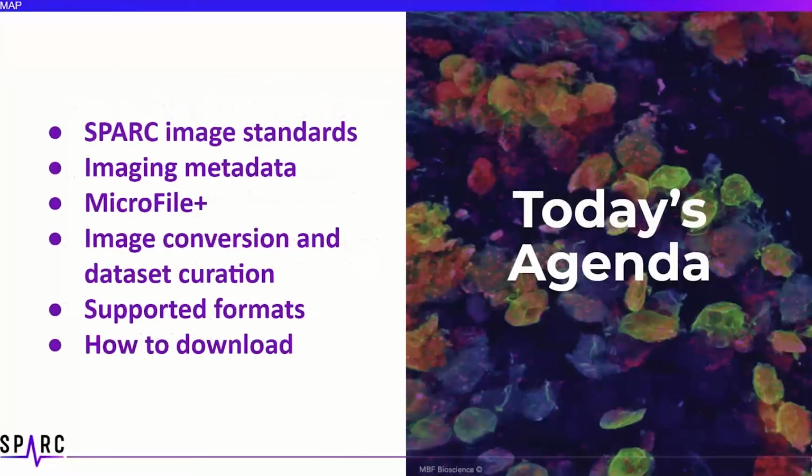Today, we're going to talk about the SPARC data standards relating to optical microscopy imaging data and metadata, how MicroFile Plus is used by our team to curate data sets submitted to the SPARC portal, and how you can use MicroFile Plus yourself to prepare your data for dataset submission.